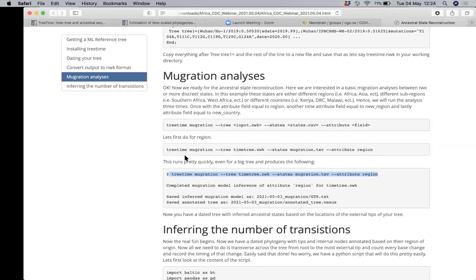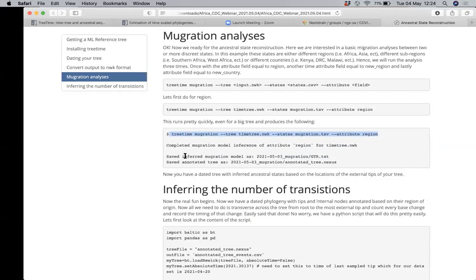Everything's still fine? Okay. Yes, looks good so far. So the new region that you created, is it the one that was assigned? Yes, assigned. So when you ran the migration command, did it take the new region or the old region? It went by the regular region.